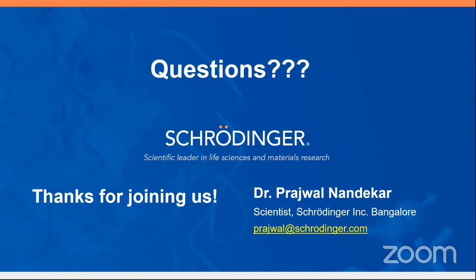I think the question is more to do with can you just draw protein structures in Maestro? Yeah, I think, okay. If I have not misunderstood this question, whenever we talk about protein structure, it has a 3D fold. But if you simply talk about building a peptide chain, then yes, using a simple amino acid residue sequence, you can build a peptide with, let's say, 10 or 15 amino acid residues, but that is called a peptide structure, not a protein structure. So if you are talking about protein structure, then homology modeling is the option.